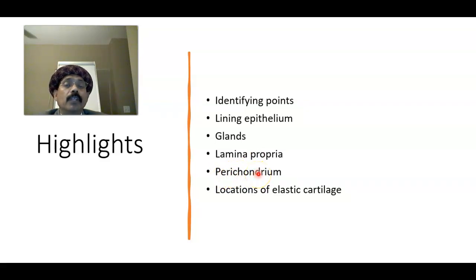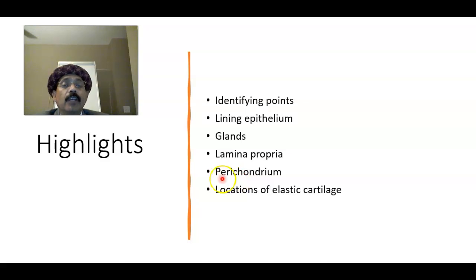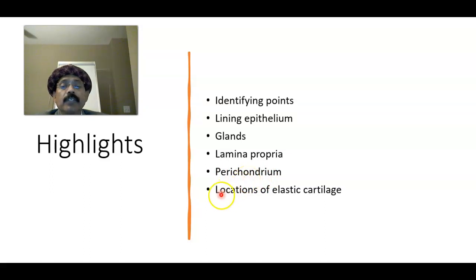The perichondrium has two layers: one is the fibrous layer containing fibroblasts, and the other is the cellular layer containing the chondrocytes. The perichondrium covers the cartilage on both surfaces.